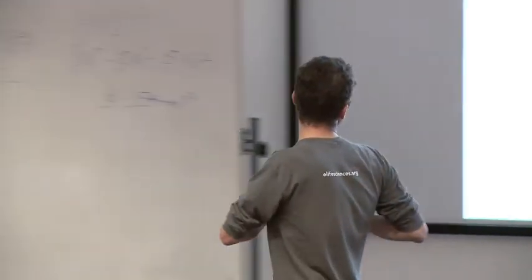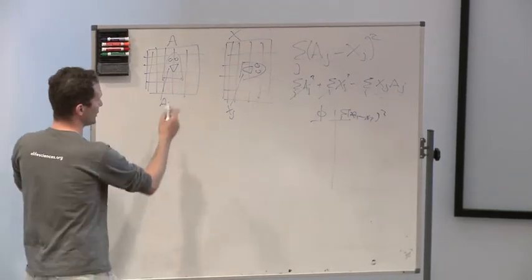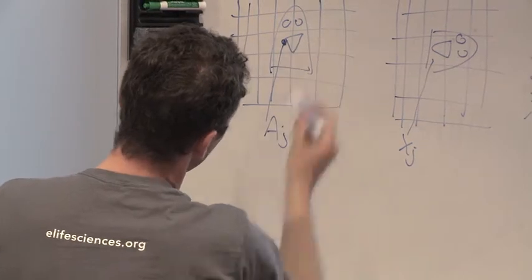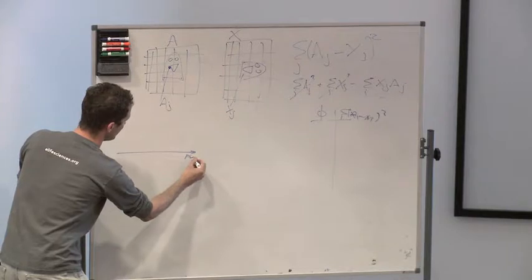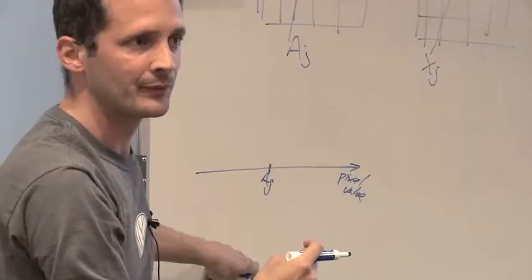It calculates a probability of observing the image given that reference image in any orientation, okay? Now, if I plot the value of this pixel here on an x-axis, okay, this is pixel value. And this now happens to be for pixel j, value aj, okay?